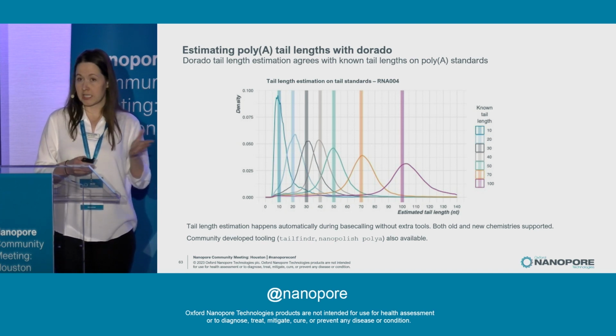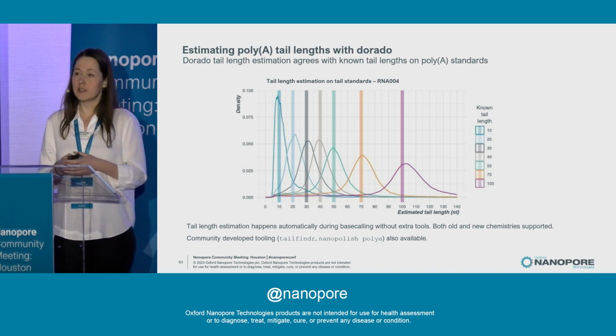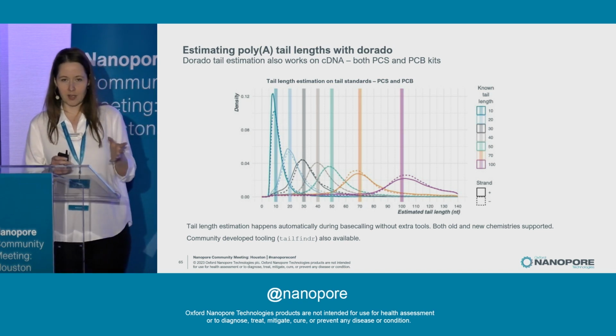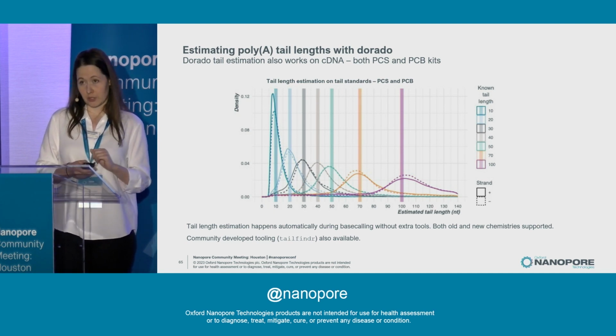There are also some community-developed tools for poly-A tail length estimation, and they give very similar results on these tail standards. And just a quick side note to say that if you have PCR material, cDNA libraries, Dorado tail estimation also works on those.